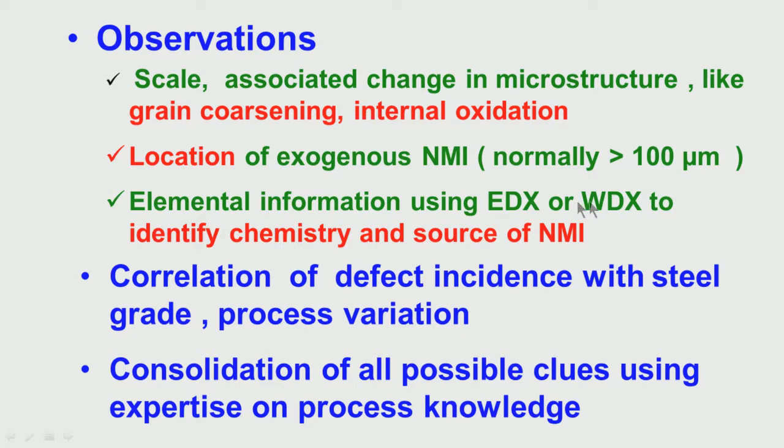That is why EDX and WDX attachments in SEM are important for localized information, for getting information from very small areas, for inclusions, for entrapments. This is the whole idea of analyzing it. Normal chemical analysis and X-ray fluorescence give you information from a large area, but from the EDX and WDX attachment in SEM, you are getting information from a small area: a small area of the micrograph, of a microconstituent, of an inclusion, of an entrapment. All of this can be analyzed.